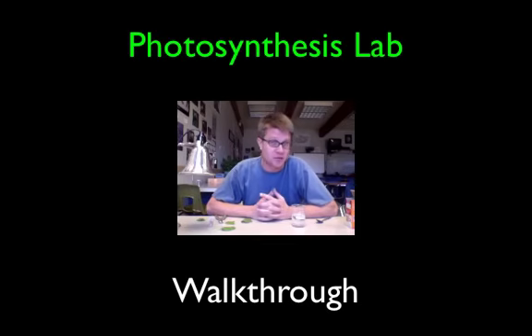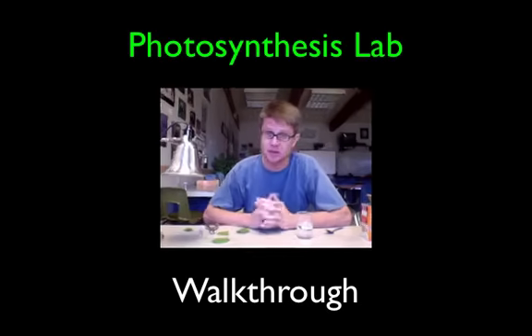Hi, it's Mr. Andersen. Today I'm going to show you how to do the photosynthesis lab. It's a really fun lab, but it can be a little frustrating if you can't get your leaf chads to sink.